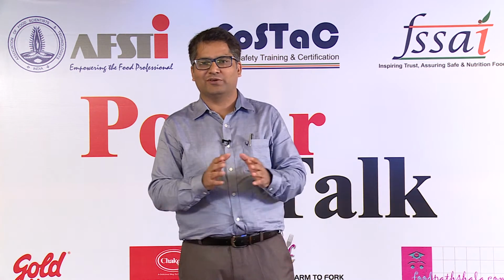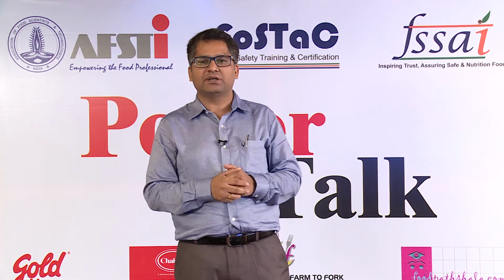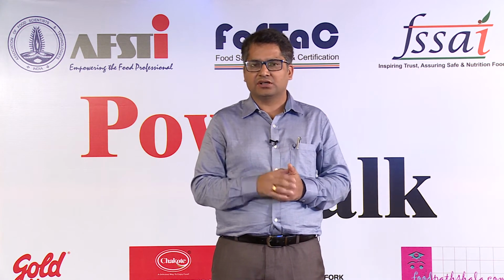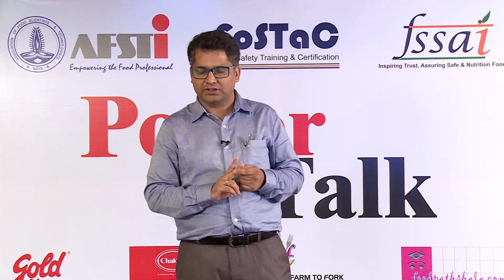Everybody has told you how to fortify and what to fortify. Now it's my duty to tell you how to measure it and what the challenges in the measurement are. There are many things to measure, but I will be taking on the challenges which we face in mineral analysis. What are these challenges actually? There are only two challenges: one is overestimation and the other is underestimation.